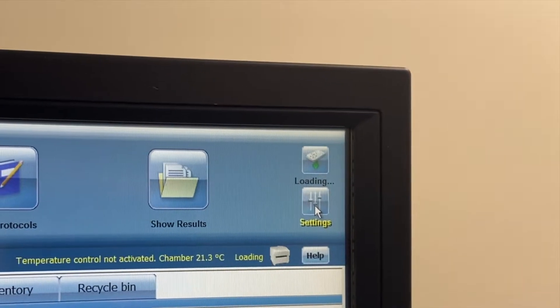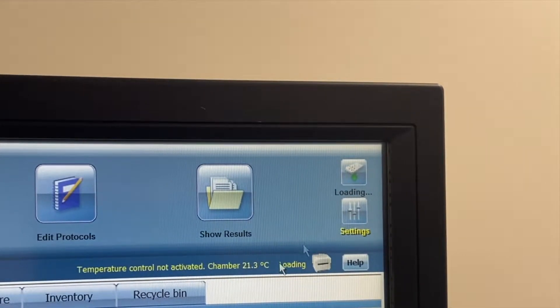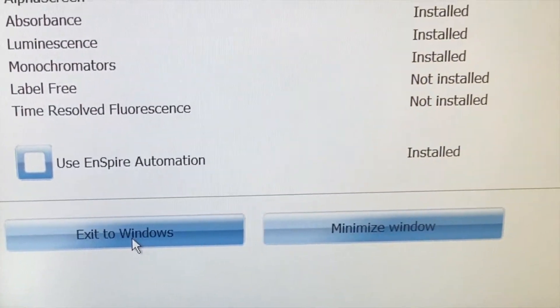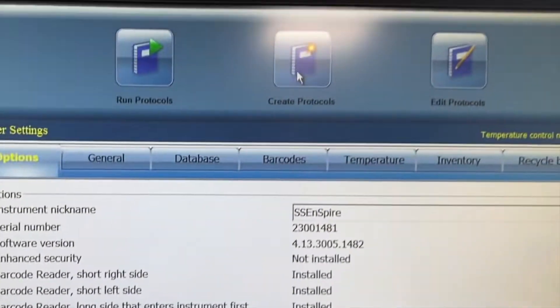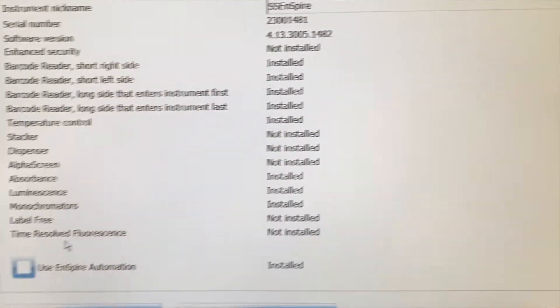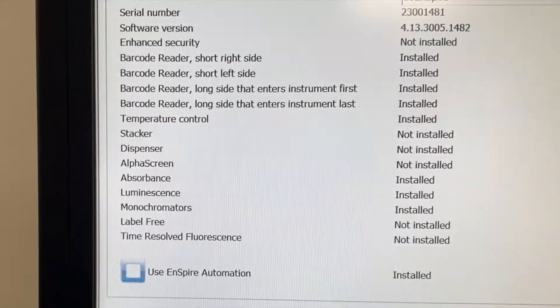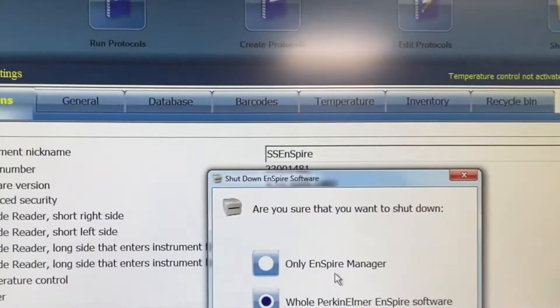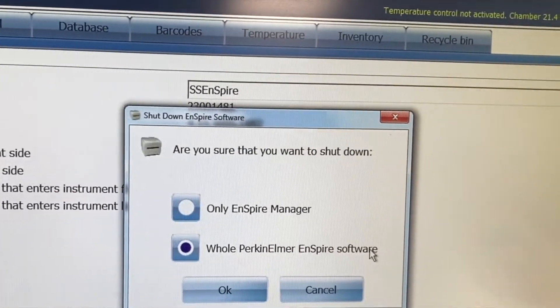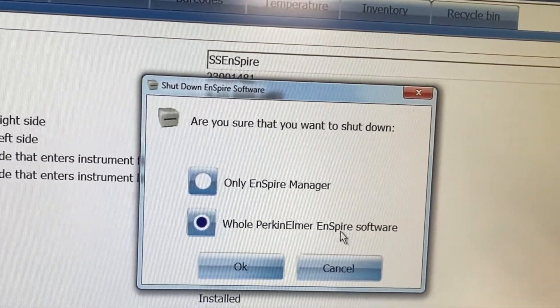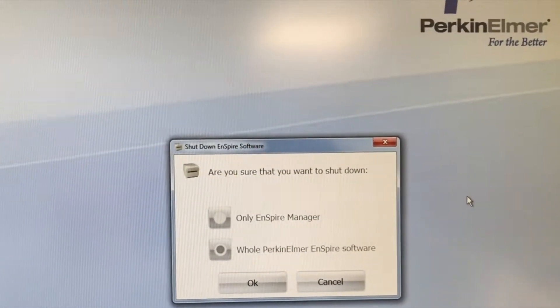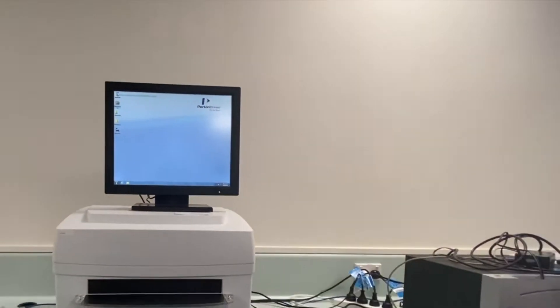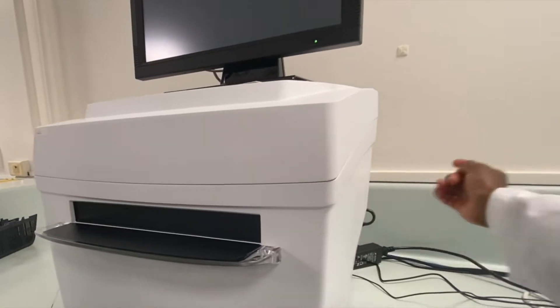Now let's go through exiting the unit. Closing down is a little unintuitive — you actually need to go to Settings after you finish your run. In Settings, select 'Exit to Windows' — that's how you close the software. You can choose to close only the Inspire Manager, or if you don't need any other functionalities you can close the whole Perkin Elmer Inspire software and press OK. Wait for it to shut itself down, and then you can turn off the actual computer by pressing the button.